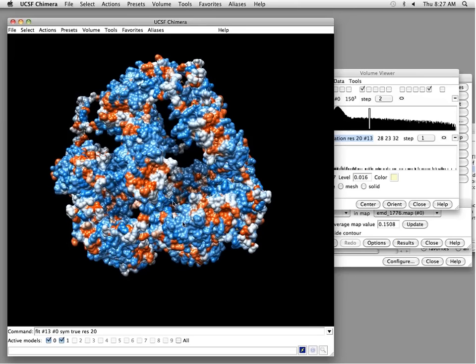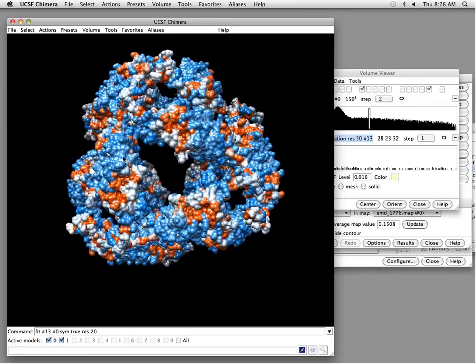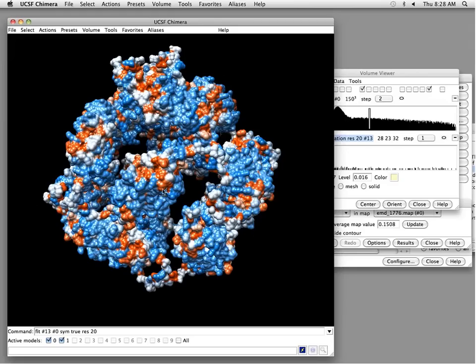And you can imagine that if I have a nearby unfolded protein and it has hydrophobic regions, it might displace one of these C-terminal tails from its orange groove, and it might bind there. And there's an interesting experimental observation that when this alpha crystallin is capturing unfolded proteins, the cage-like structure of these many copies of the dimer falls apart. And that would agree with this concept we have that the C-terminal tails hold it together. If the tails were displaced because some denatured protein was competing for the hydrophobic binding site, then the thing would fall apart.